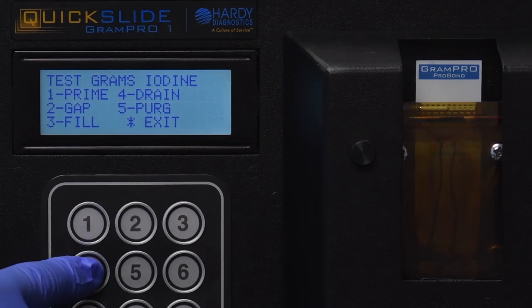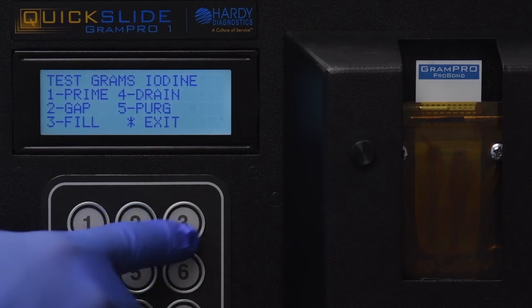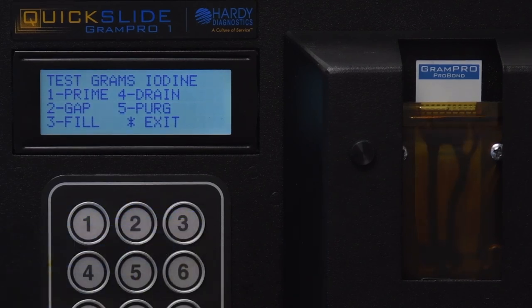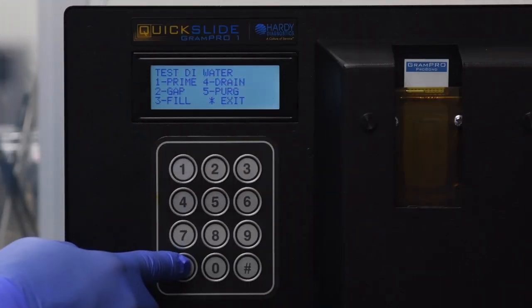You may verify the calibration by pressing the following sequence: press 1 to select Prime, press 4 to select Drain, press 2 to select Gap, press 3 to select Fill. After these steps, the grams iodine levels should return to the new calibrated level of reaching the top of the two Phillips head screws. Press star once to exit.